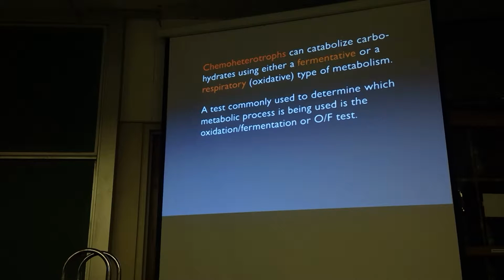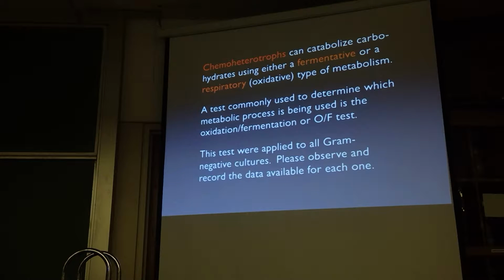So this is primarily for gram-negatives, but it is very applicable to semester project organisms. If you have a gram-negative for your semester project, run an OF, because you want to know, can they ferment or are they respiratory? So all gram-negatives, you get to do this.